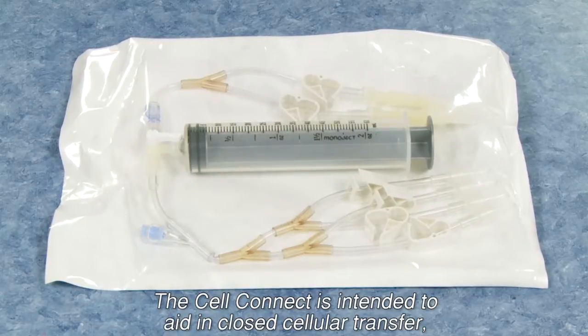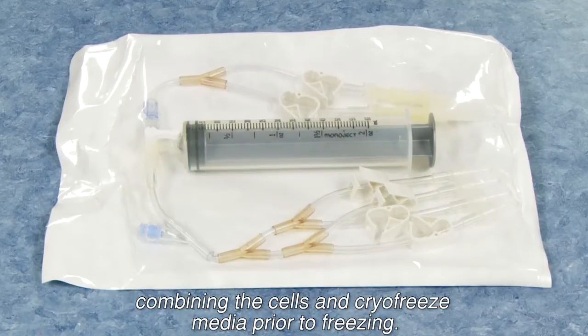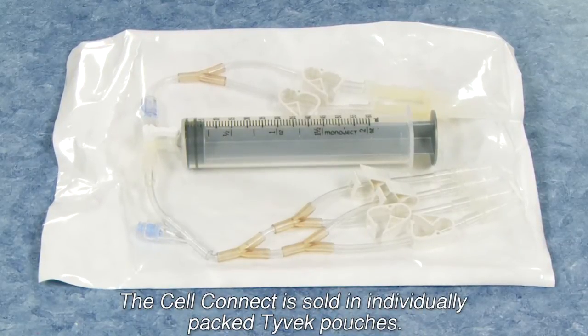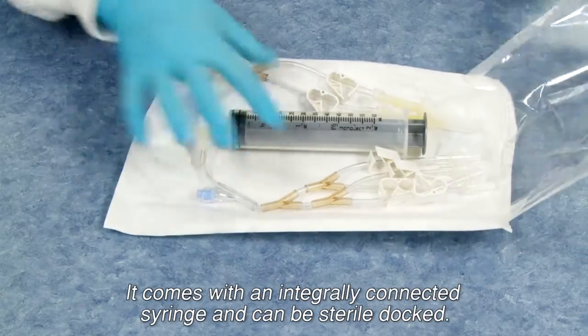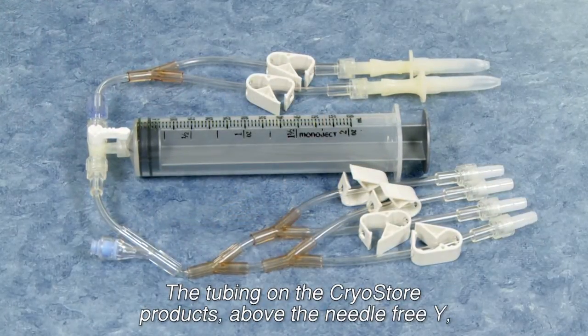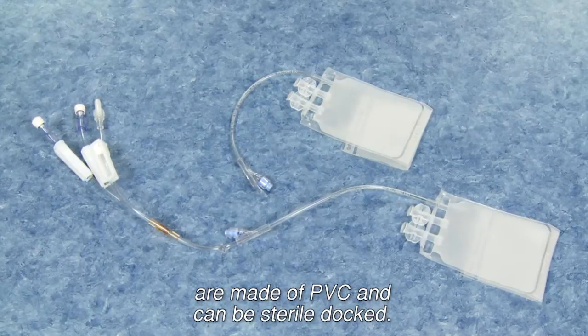The CellConnect is intended to aid in closed cellular transfer, combining the cells and CryoFreeze media prior to freezing. The CellConnect is sold in individually packed Tyvek pouches. It comes with an integrally connected syringe and can be sterile docked. The tubing on the Cryostore products above the needle-free Y are made of PVC and can be sterile docked.